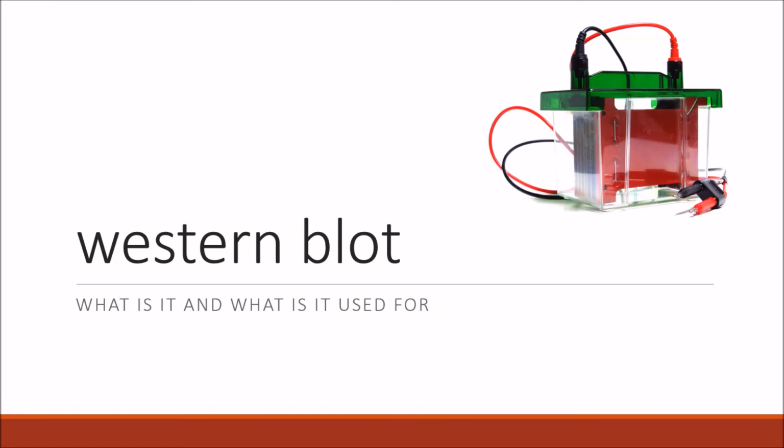Hello and welcome to the introductory video for the Western blot. In this short introduction, I'll show you what it is and what it is used for.